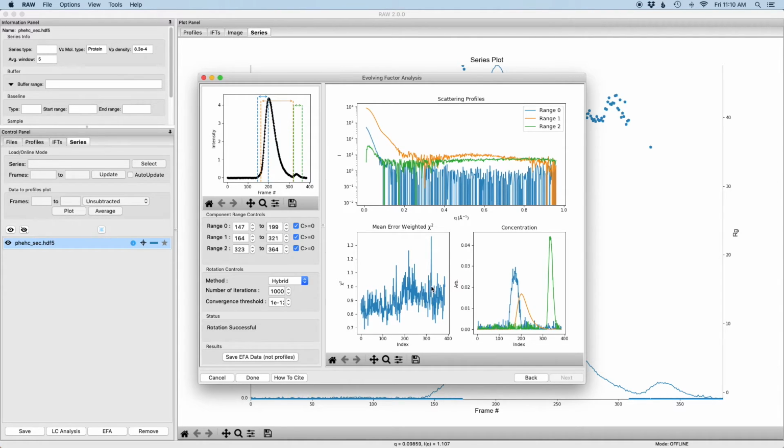You can see there's a spike somewhere around 300, 320. We have two components that are in that range, so it's not clear which one I want to adjust or which way to adjust it. So I'm going to start with this 321 here and try adjusting that down. You can see as I do that, that component grows. So I'm going to bring that back to 321, and I'm going to try adjusting this bottom range here. I'm going to bring that down initially first. You can see that actually eliminates the spike. This makes sense. There wasn't any overlap between these ranges previously, which meant that there was a little bit of the data set here that just wasn't getting fit properly.